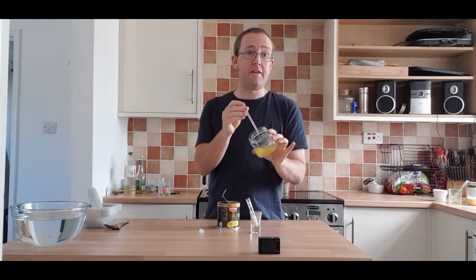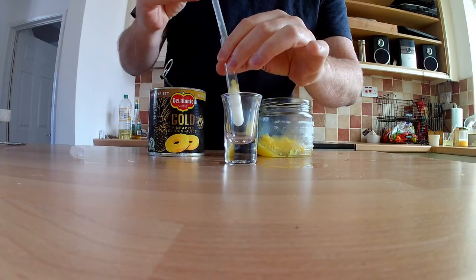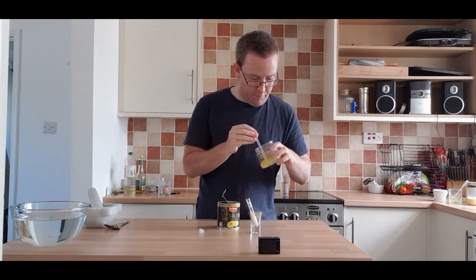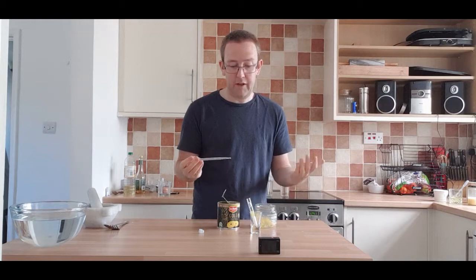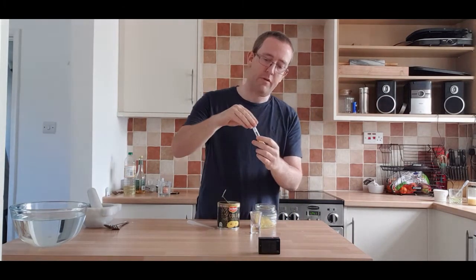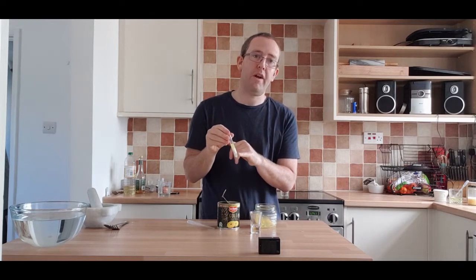So this is just some blended jarred pineapple. And I'm just going to see if I can suck a bit of this juice up here. Like so. Pop it in with our egg white. Now, this won't be as effective as fresh pineapple because, of course, the pineapple before it's been in the jar, been in the can, has been cooked. It's been heat treated for sterility, and it's been canned. So I wasn't sure that this was going to actually do anything. But there does appear to be enough bromelain activity in this pineapple juice to break down this protein.